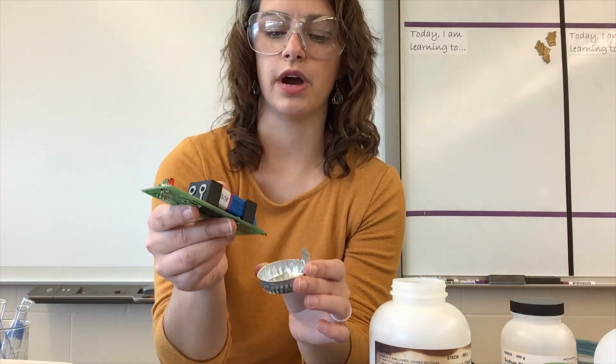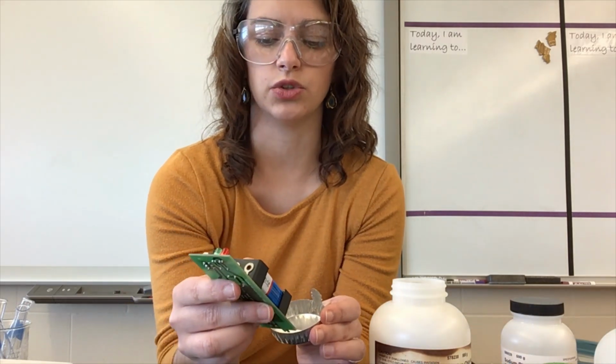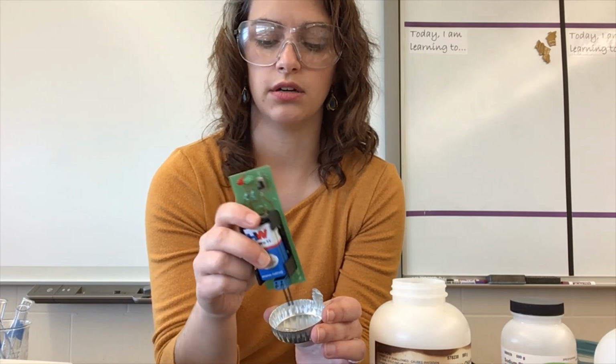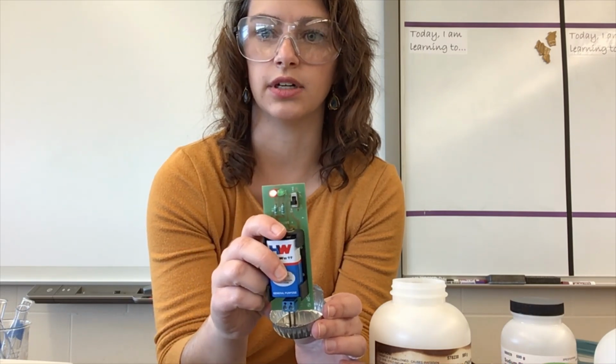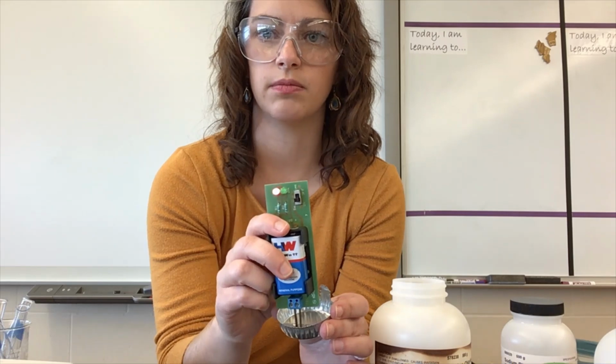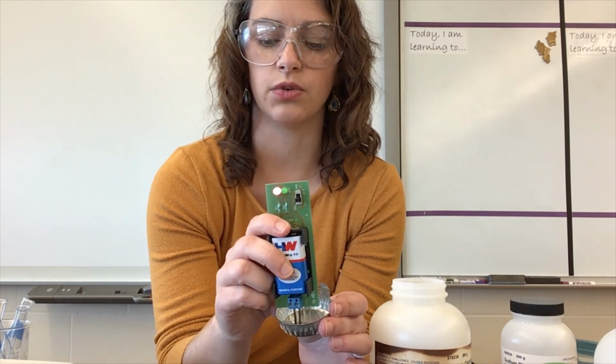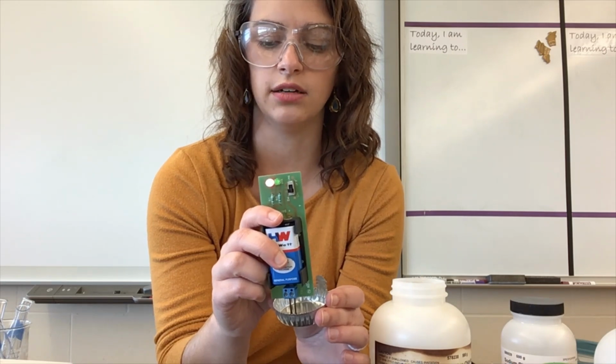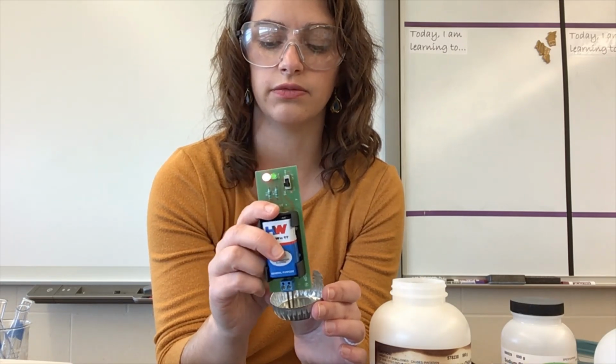And then I'm going to go ahead and test my solution. And maybe you can see it, but the red light definitely, there you go. Yep. The red light lights up, therefore it is conductive in solution. So no for a solid, yes for solution.